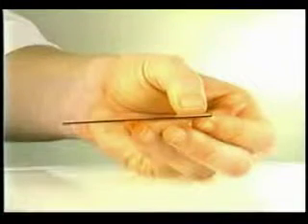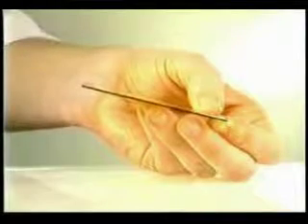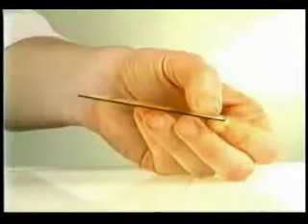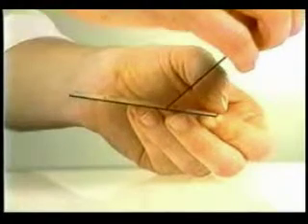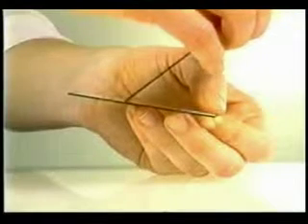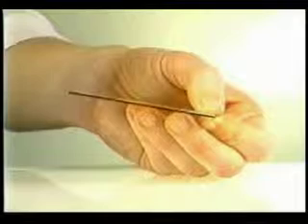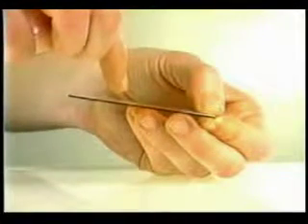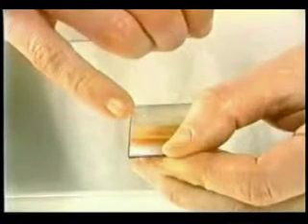Fragments of tissue can be concentrated for smearing in a second way by first tilting the slide slightly toward the frosted end. Then use a clean slide to sweep all the material toward the frosted end, and without lifting the slide or changing the angle, move the top slide to the middle of the bottom slide. Lift the top slide straight up. This will result in a concentration of fragments across the bottom slide right here.